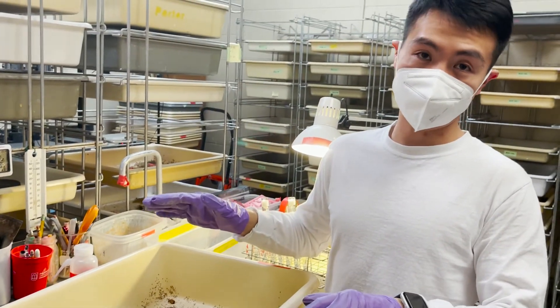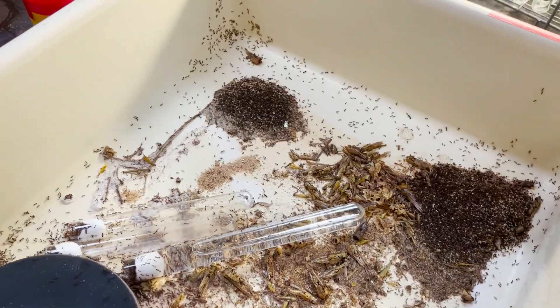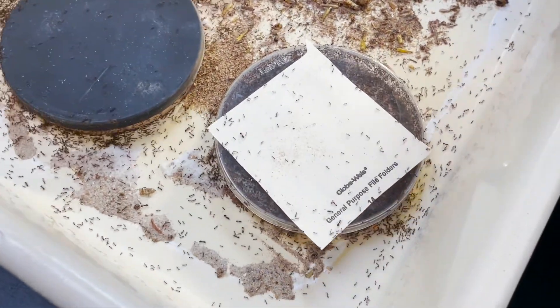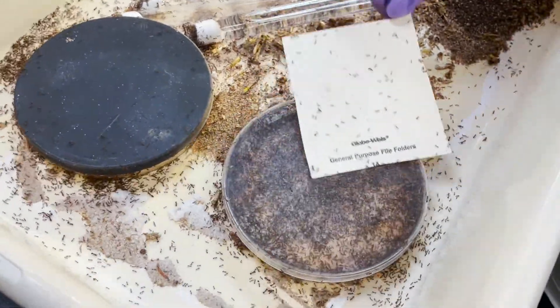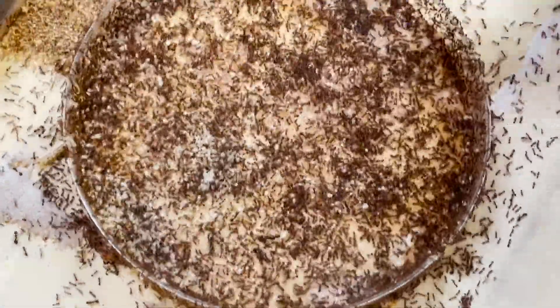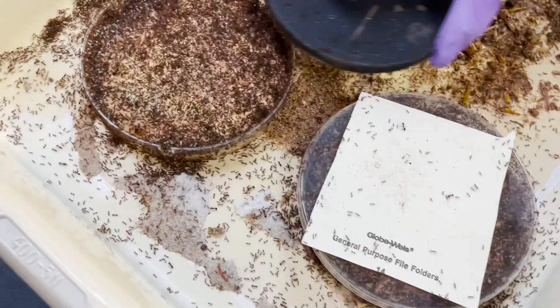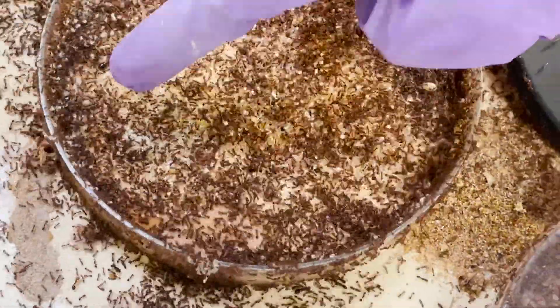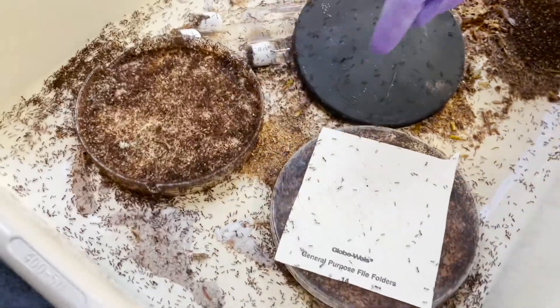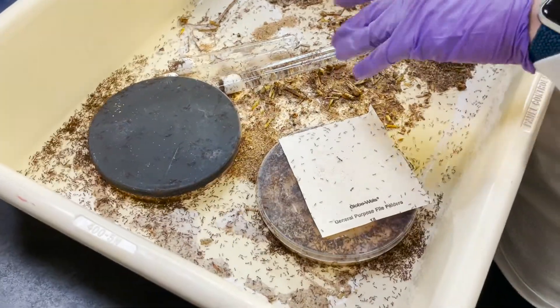What we have here is a polygyne colony, meaning they have multiple reproductive queens in a colony, in comparison to monogyne where they only have a single queen. Our lab studies how colonies go from a single queen to multiple queens. If you open it up, you can see — that one is a queen, that one, that one also — so there are four or five queens in here, and probably more. This is a healthy colony with a good number of larvae and pupae. When watering them, just give them a little bit of water, and be careful not to smash the queen.